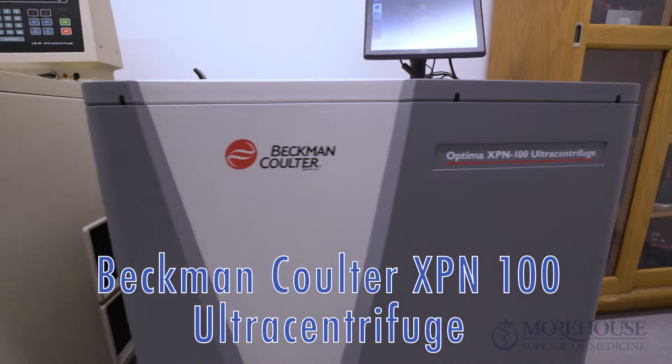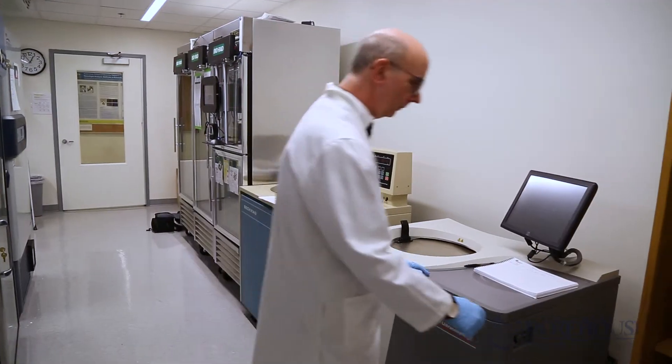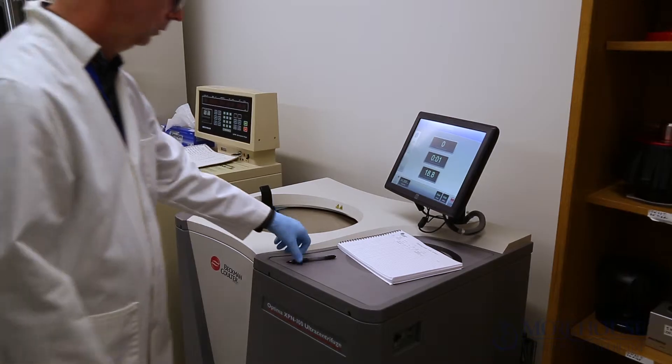Beckmann Coulter XPN 100 ultracentrifuge. Turn the power on and complete the log sheet.